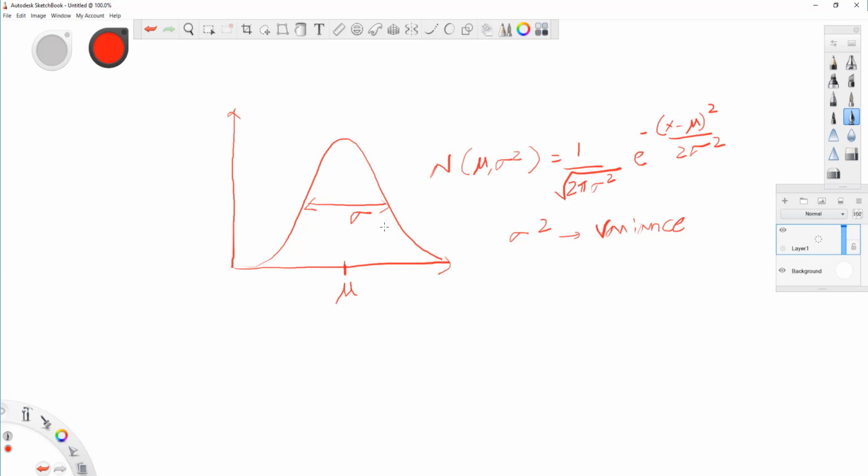So that's it. So Gaussian mixture model is nothing but take a bunch of these Gaussians, and mix them at a specific ratio, and then combine them to define the original data. Okay, and why Gaussian? Why not something else? Well, many data sets are Gaussian. That's as simple as it. Many data sets follow a normal distribution, which is represented by a Gaussian. That's why it's Gaussian mixture model.